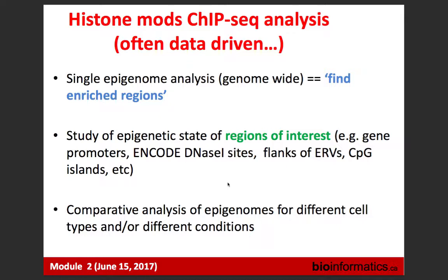So it's kind of de novo, right? We have data, and we will data mine our data set, find locations which are different from other locations. This is one thing. We don't have any biases prior to our analysis.